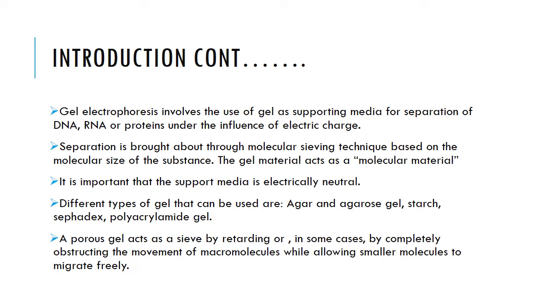Once that electric charge has been applied, that's when we observe the separation of proteins. The technique by which this happens is what we call molecular sieving. I know we've used a sieve before. So the molecular sieving technique is what is used in gel electrophoresis.